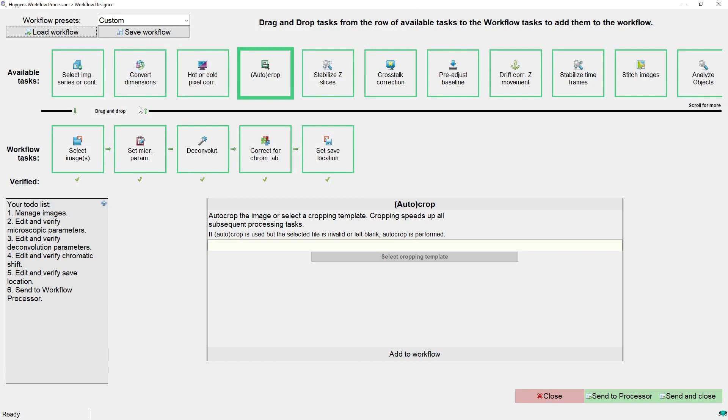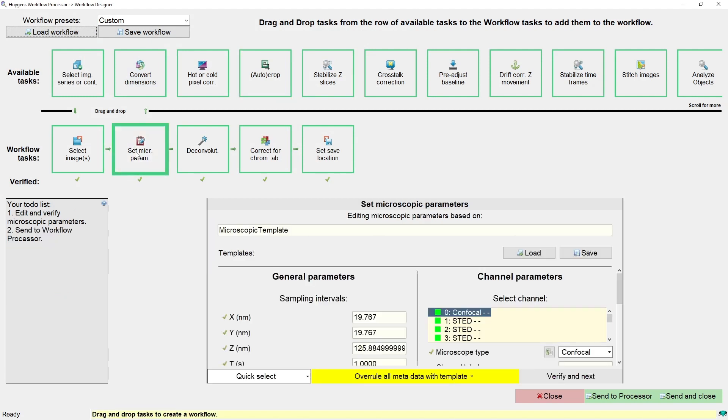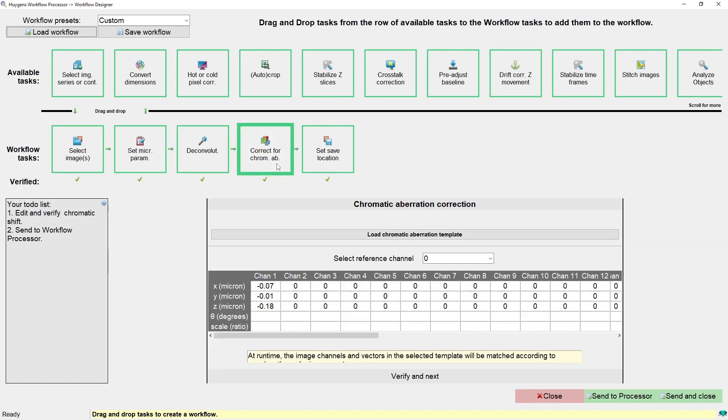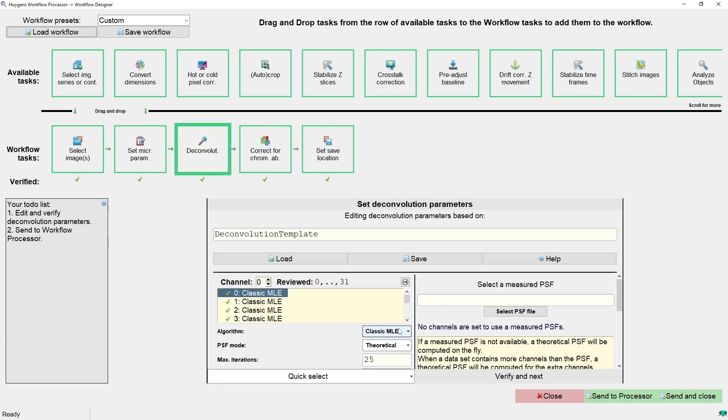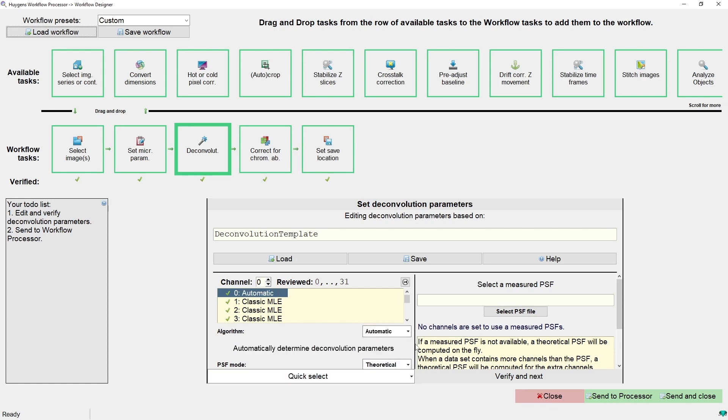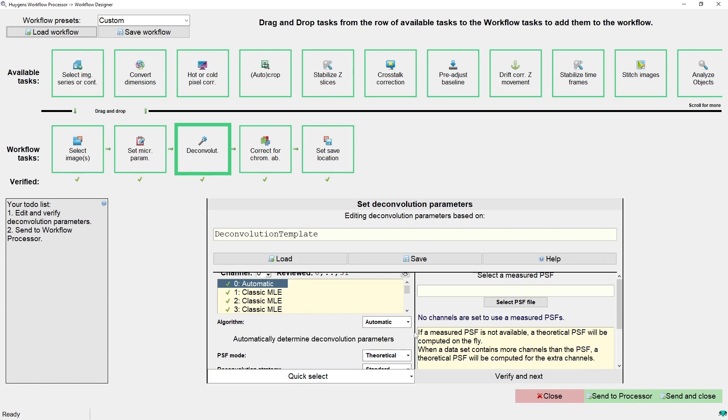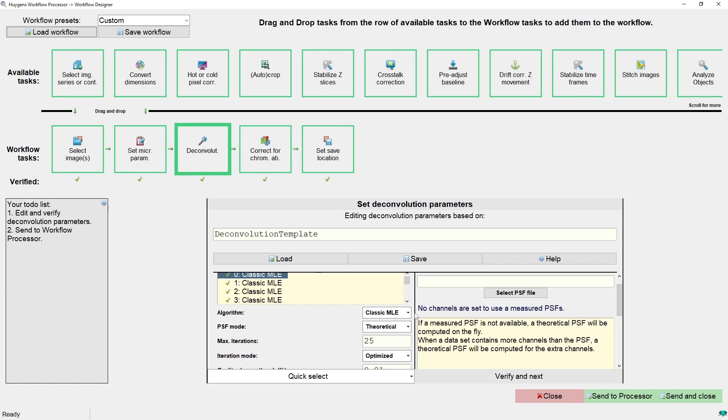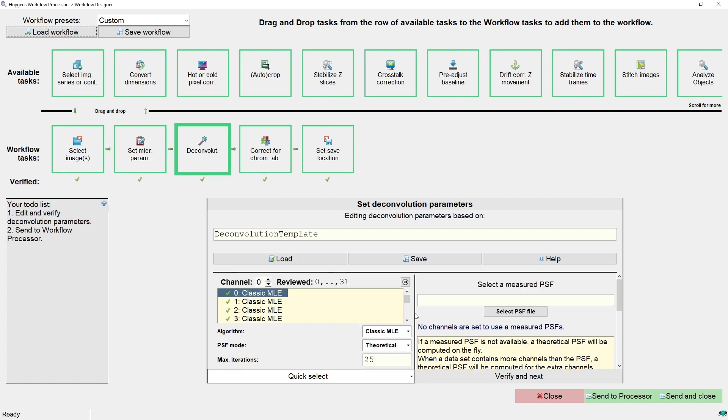This workflow processes an image with a confocal and stat channel that need to be deconvolved, and they have a bit of chromatic aberration, so it corrects the chromatic aberration as well. Some newer features I want to highlight in the workflow designer before sending this task are the new deconvolution algorithm called automatic, which will automatically decide on which deconvolution algorithm and settings are best in the same way the deconvolution express works. In this case I will go back to the CMLE.